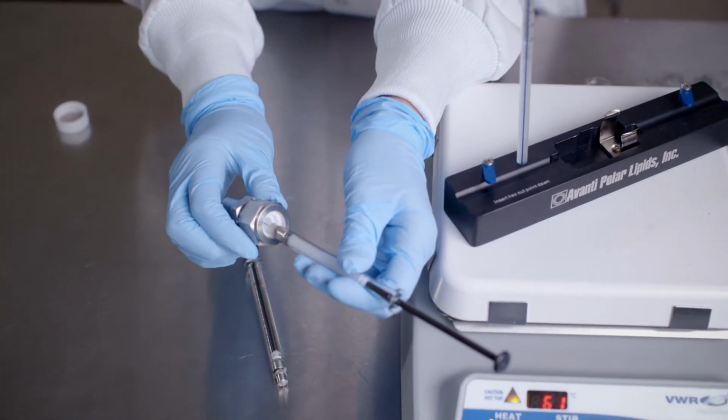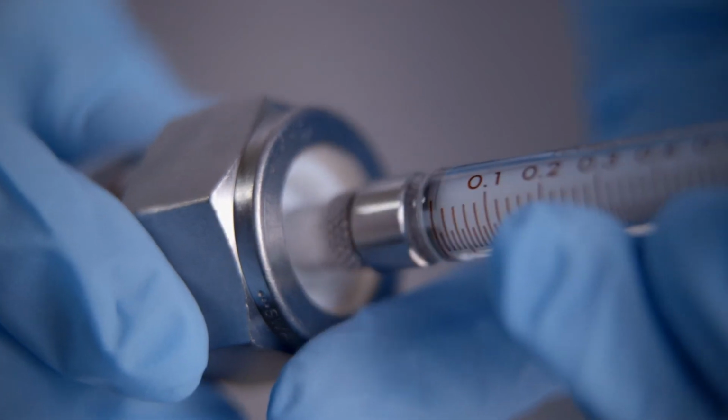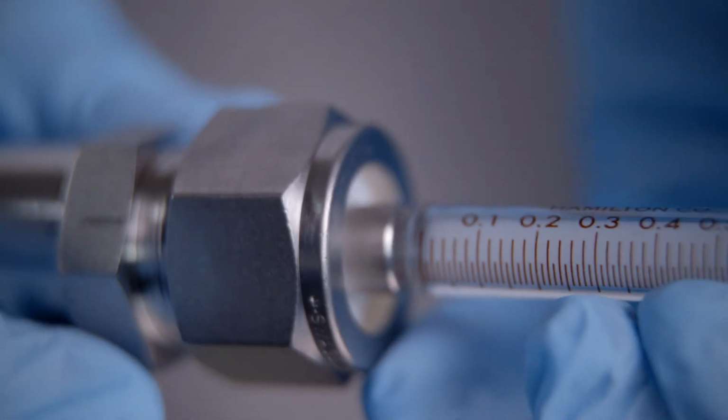Carefully insert this gas-tight syringe into one end of the extruder. As a quick tip, in order to reduce the dead volume, pre-wet the extruder parts by passing a syringe full of buffer through the extruder and then just discarding the buffer. Additionally, new syringes may have tight-fitting parts, so to facilitate extrusion, it may be necessary to pre-wet the barrel and plunger with buffer prior to inserting the plunger into the barrel.